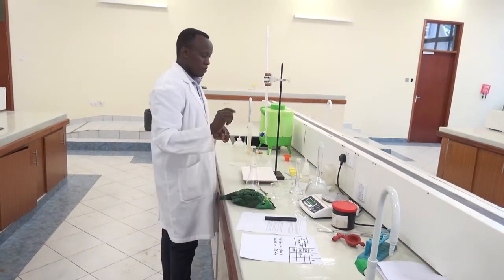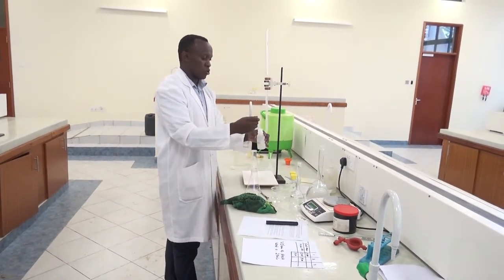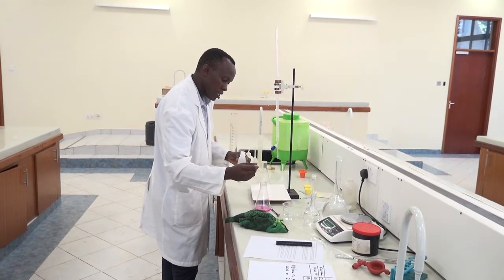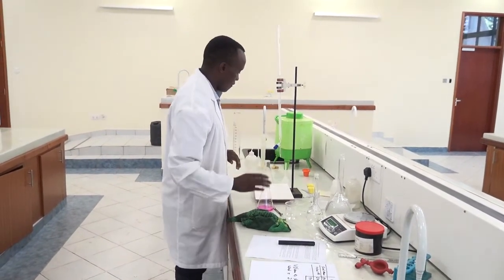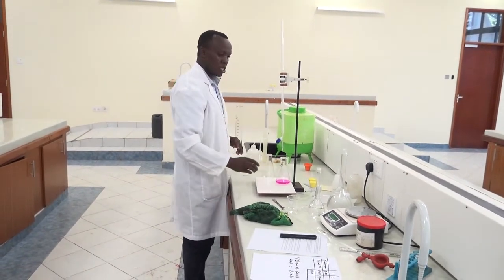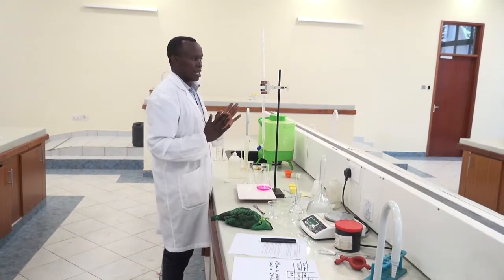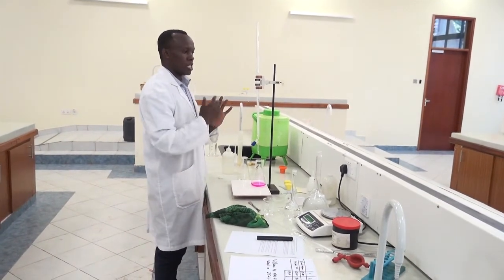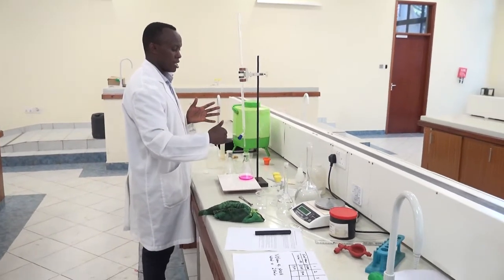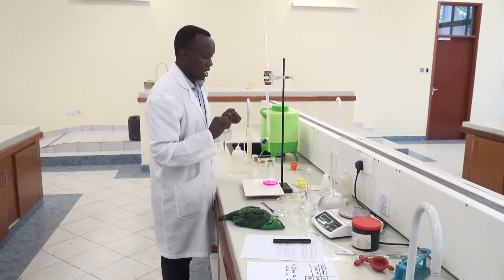Then I add the same amount of the indicator, phenolphthalein. The first titration I added two drops, and with the second titration I also add 2 drops of the indicator so that I can have uniform results. After that, I start my titration, and since my first titer value was 19 and it was not that exact, I'll make a continuous titration. Let's say, for example, I'll run the acid for around 15 mLs, and then from there I'll add drop by drop so that I can get the exact endpoint.